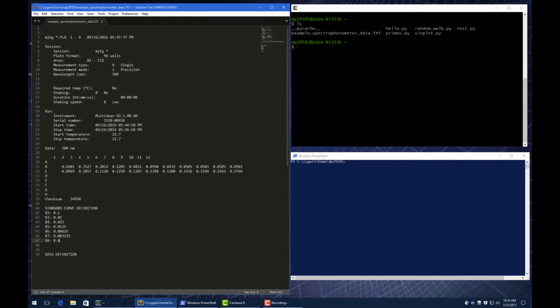And so we had the 0 concentration. And so that's what my standard curve was from my lab notebook. And that's what all this data means up in the B column. Okay, and there's a couple of blank numbers because that's just how you had to read it and we don't care about those, so I'm not going to define those at all.